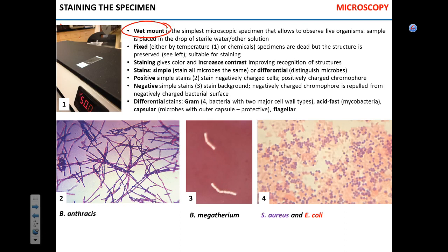What can you do with it? You can put a cover slip on it, and that's going to be your live specimen. That make sense? Stick it under the microscope, look at it, you see bacteria moving around. You can't really get much out of it. They're moving around, so what? Maybe you can observe them moving towards increased concentrations of chemoattractant, but only if you add one. Now, bacteria are moving. That's one problem with observation. It's much harder to look at something that moves.